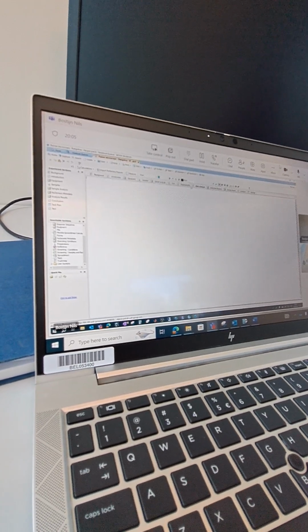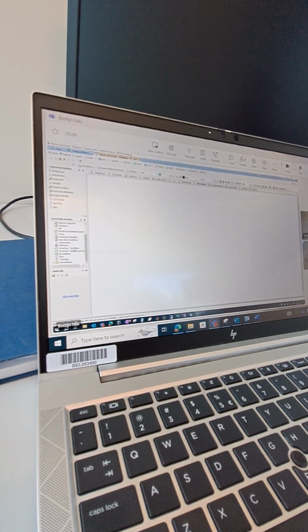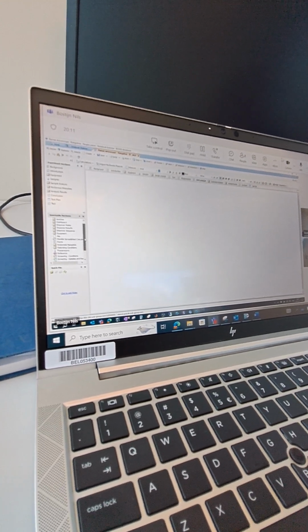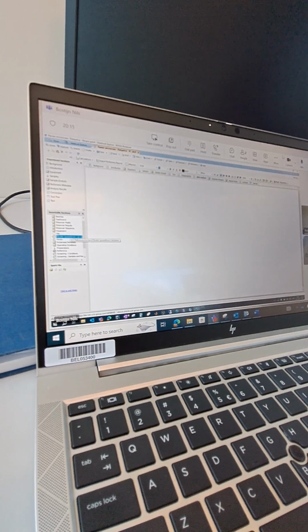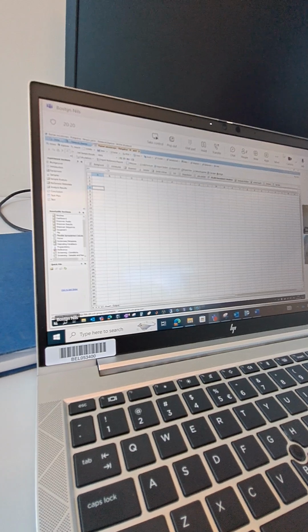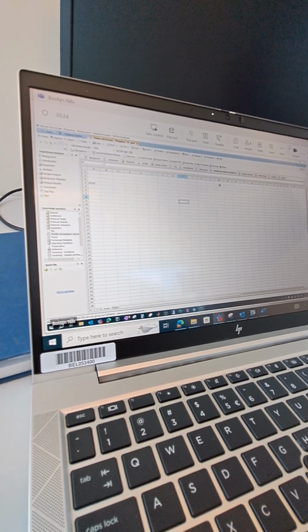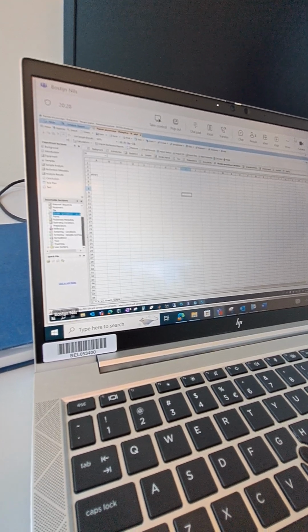Basic stuff. So this one might be interesting, the text section, and then we also have an Excel spreadsheet. So here you have flexible spreadsheet calculations, and this is basically like an Excel file. Okay. So for the rest, I don't think there is interesting stuff for you.